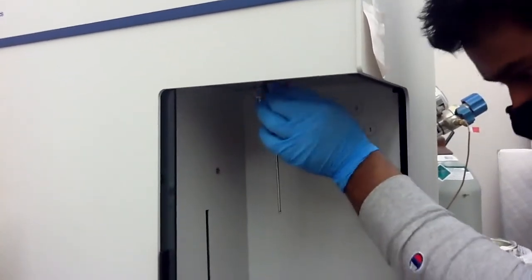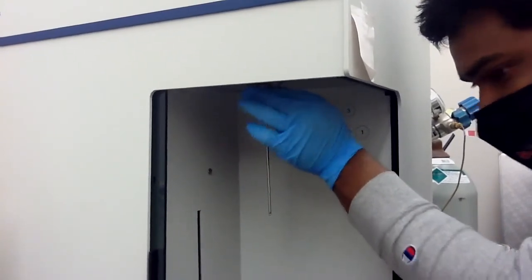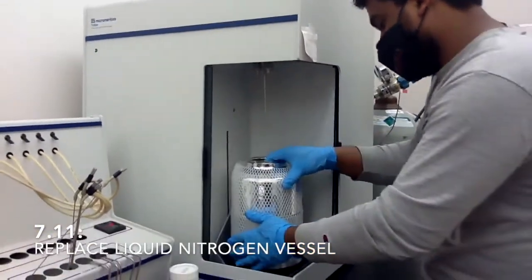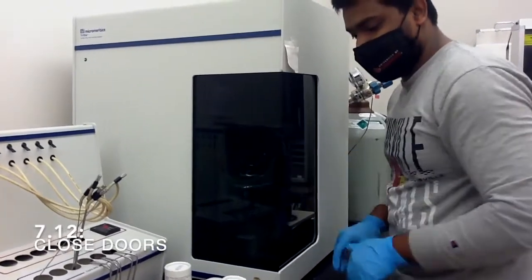Don't keep it open. So always after finishing your experiment, take the tube out and close it. After closing this, you can put your tube here, close the machine. Yeah, that's all.